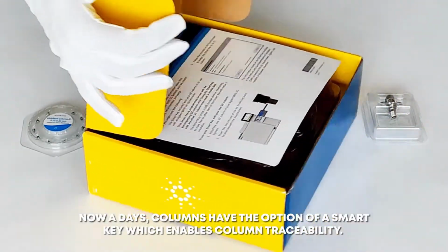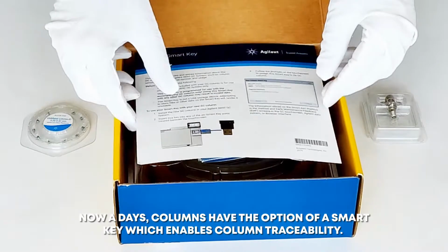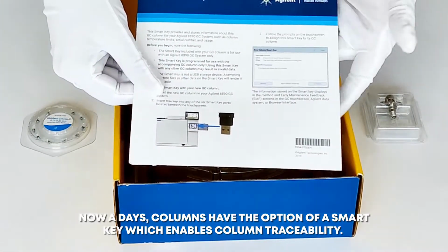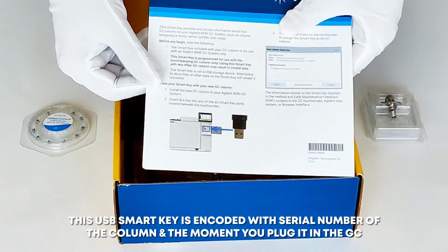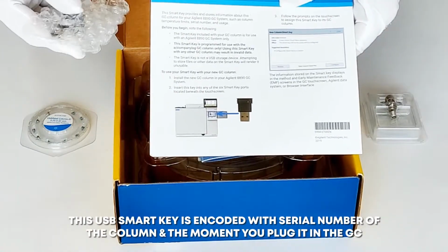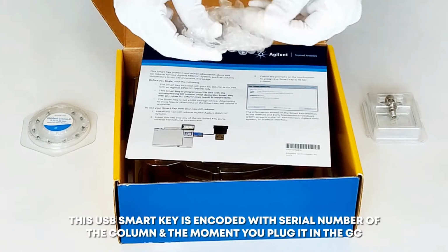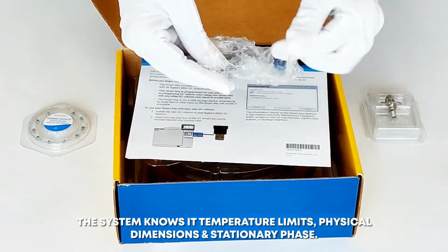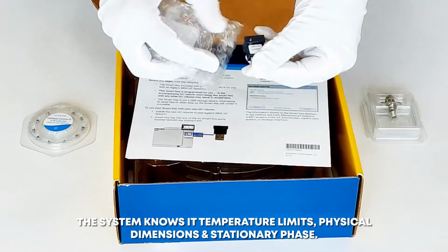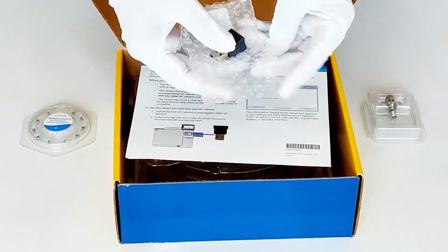Nowadays columns do come with an option of a smart key which enables column traceability. The USB smart key is encoded with the serial number of the column. The moment you plug it in the GC, the system knows its temperature limits, physical dimensions and stationary phase.